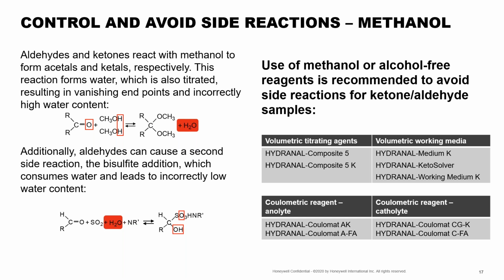So there are choices that we can use both on the volumetric side as well as on the coulometric side. On the volumetric side, you're going to be wanting to use any working media that's part of the Hydranal K series.